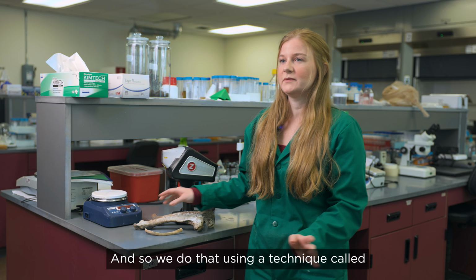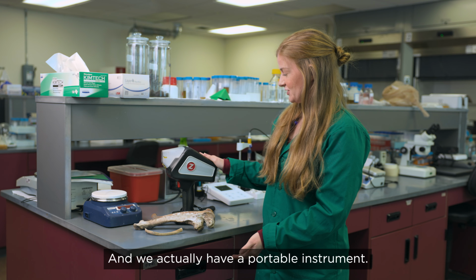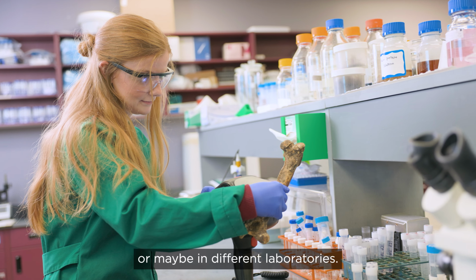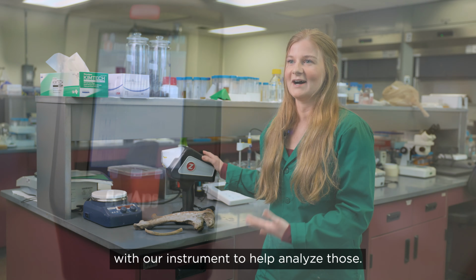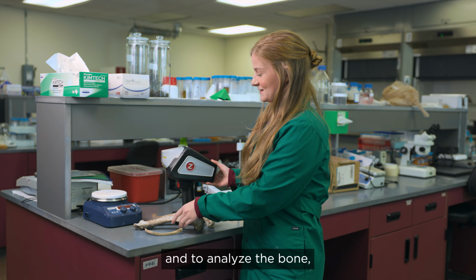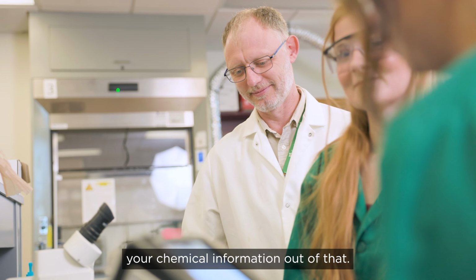We do that using a technique called laser-induced breakdown spectroscopy. We actually have a portable instrument. Bones, a lot of times, you find them out in the field, at an excavation site or maybe in different laboratories. So it's important that we are able to travel with our instrument to help analyze those. This is the example of the instrument that I use. To analyze the bone, you can just hold it up to it and press a button, and then you get your chemical information out of that.